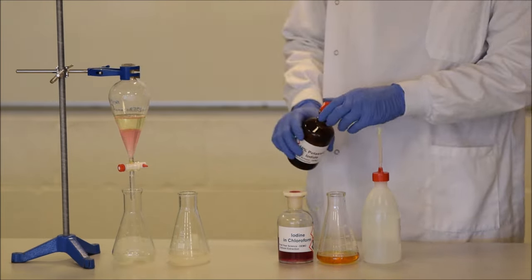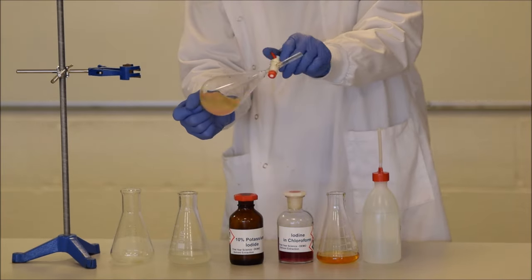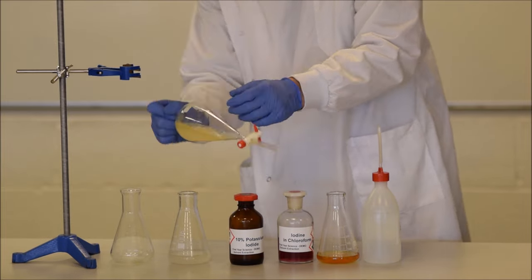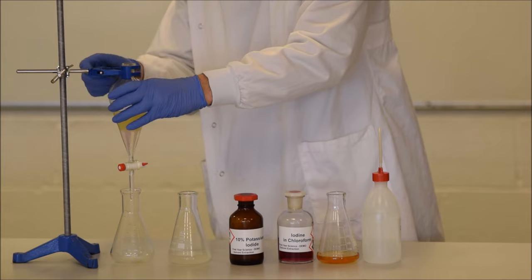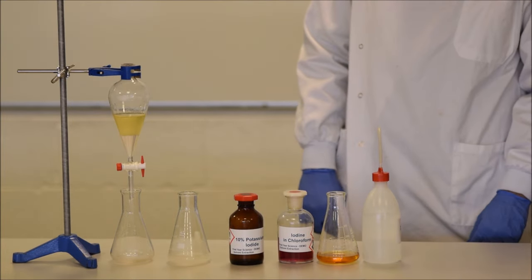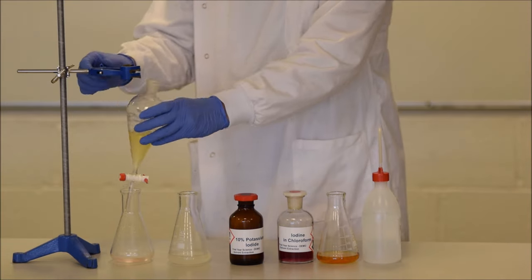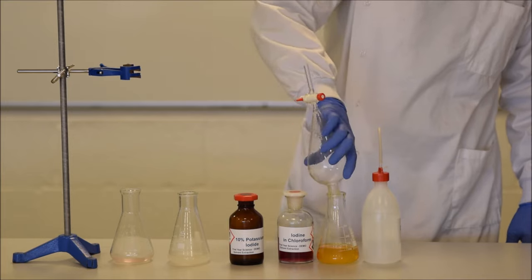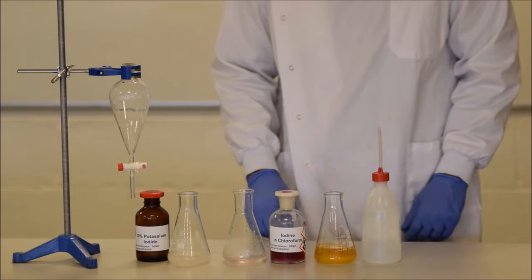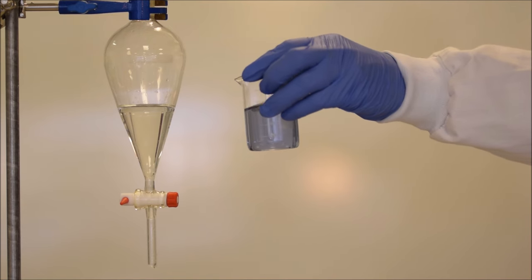Simply because it takes time for the material to transfer from one layer to another layer, and you have to give it that time or your separation is not going to work very well. So again, shake, vent, shake, vent, shake, vent, clamp it. Allow the two layers to separate, drain the bottom layer out the bottom, and you can see our chloroform is almost colourless now, so it's done a really good job, and then top layer out the top. And just to show how successful our extraction was, you can compare the purple of the old chloroform with the now extracted chloroform. Okay, on to a different example.